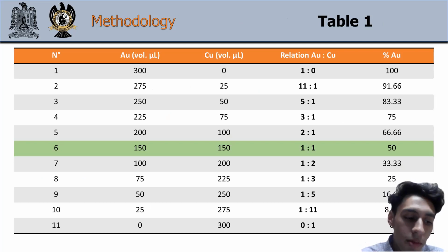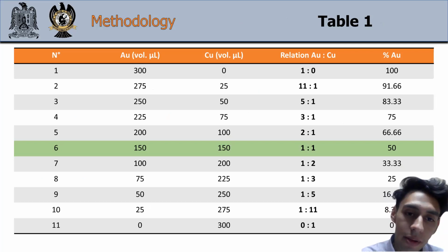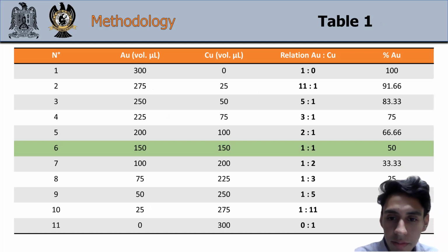As shown in table number 1, 11 samples of different molar ratios were prepared, following the method before.